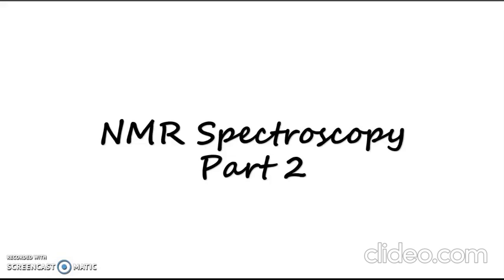Hi everyone. In the first lecture of NMR spectroscopy, we discussed the term chemical shift, which gave us the information on how the proton in a molecule resonates. So, in this lecture, I am repeating the information provided by an NMR spectrum of a molecule.